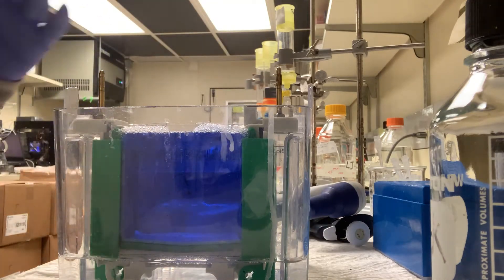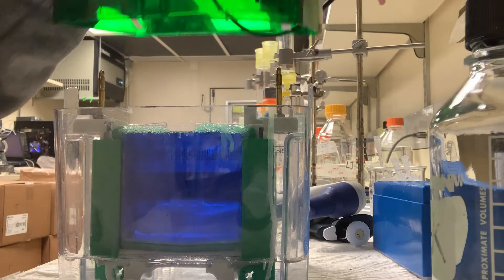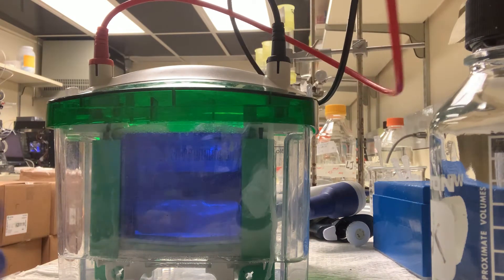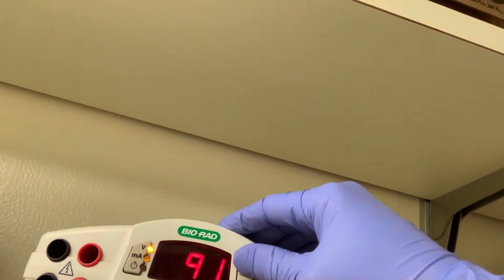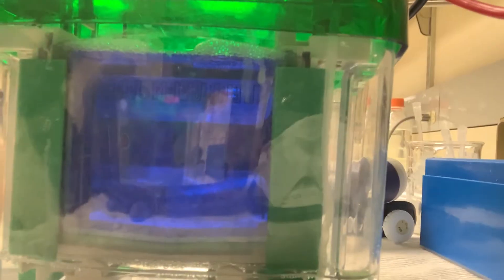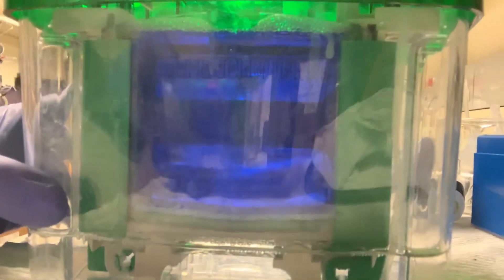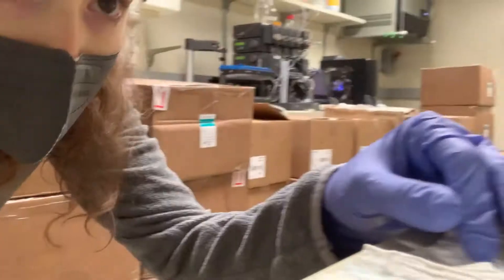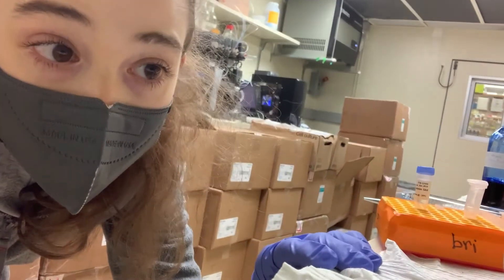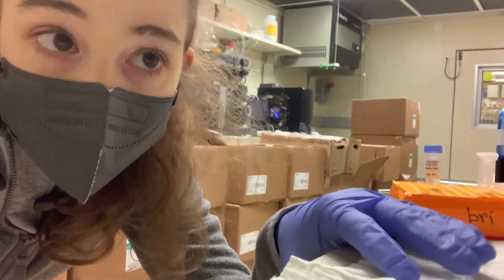And now I can start the run. I'm going to start it at about 100 volts. It's hard to see if anything's happening because you can't really see the bubbles rising when there's a bunch of blue. But it looks like it's running. Now I'm going to let it run for like 20 minutes or so until the dye and the proteins have all entered the gel.